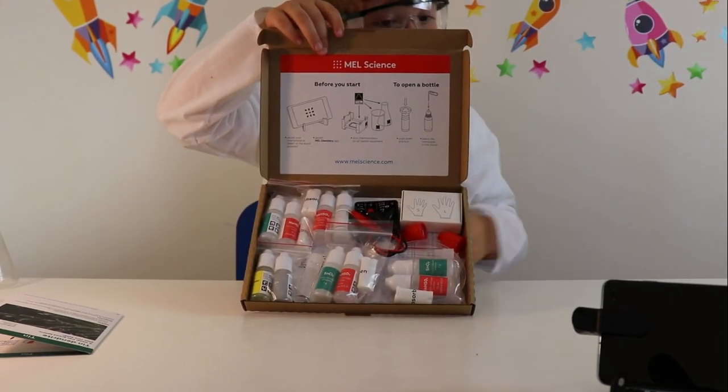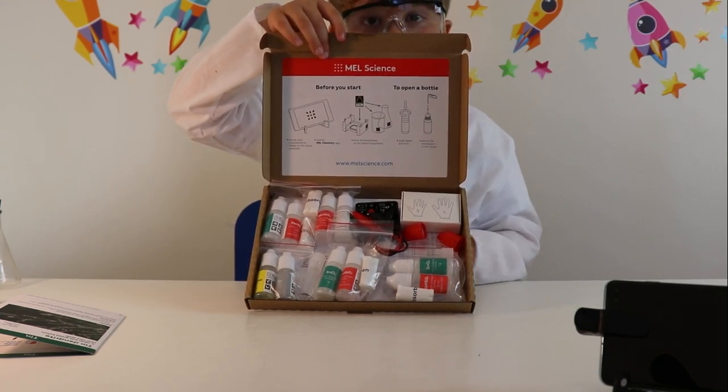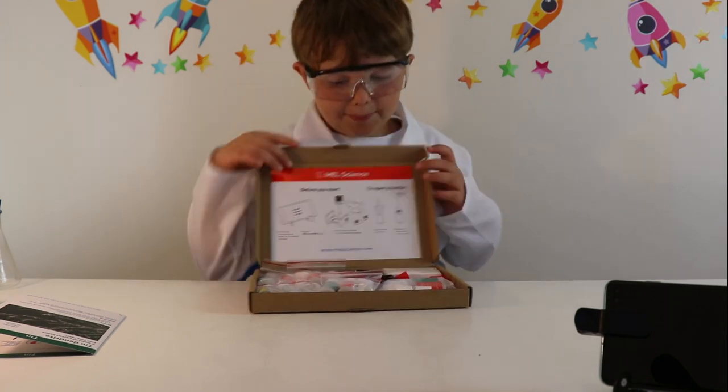Inside are all of our chemicals needed to do the experiments. We also have a small and large pair of gloves. Shall we get everything out that we need? Yep, let's do it!